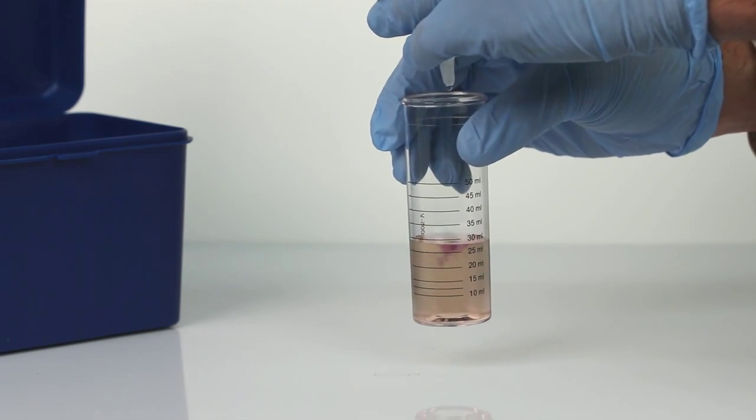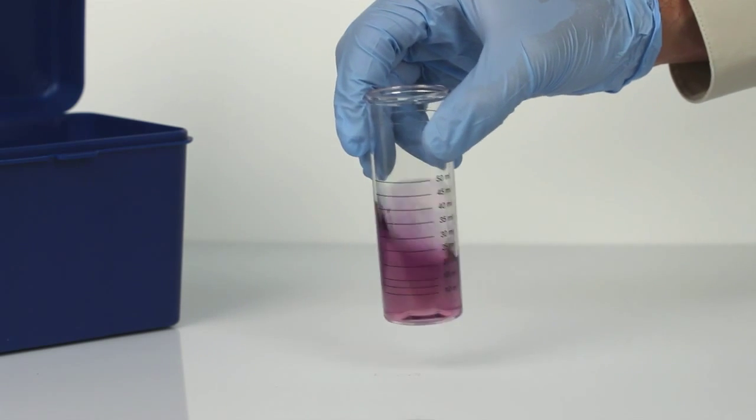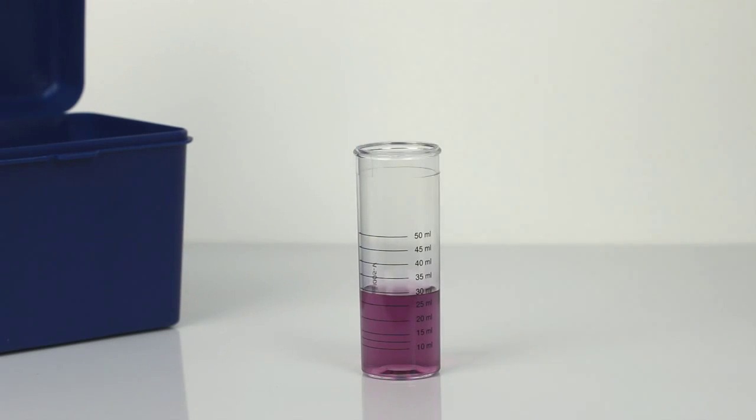Hold the bottle vertically and add the titrant one drop at a time. Swirl the vial after each drop. Count the number of drops until the sample color changes from yellow to blue-purple.